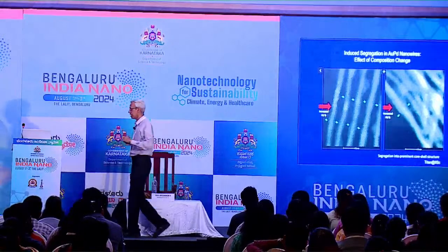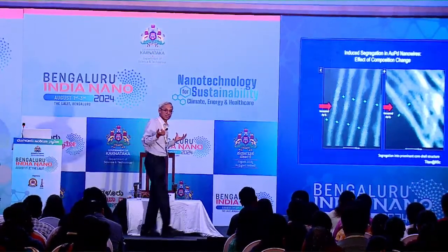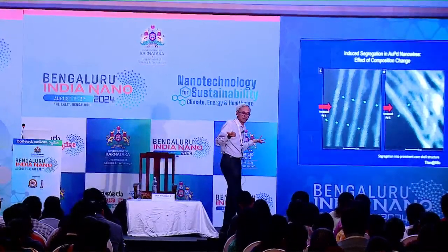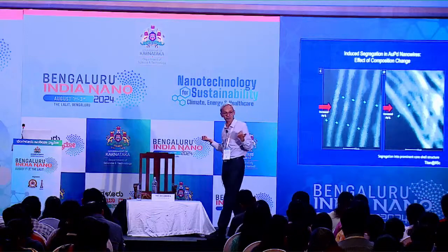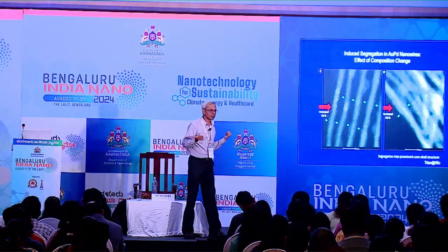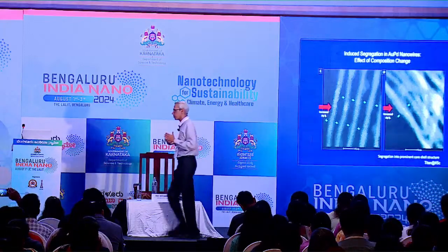We form a core-shell structure. We can make all the hypotheses and all the other things, but directly seeing gives you the proof, right? Properties will change, everything will change, and you can hypothesize that this thing might be happening. But with the use of the electron microscope, we can directly see these things happening. So that is the power of the modern day electron microscope.